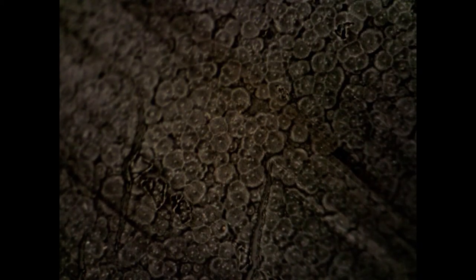This is the area of the polytetrafluoroethylene that is most dark without being jet black. Later on we'll go over areas which are jet black. You can see some breaks in the structures at various parts. I believe these are kind of like stretch marks. As the PTFE suddenly became flaccid during the test, it bent over and almost cracked the structures. This is the hypothesis.